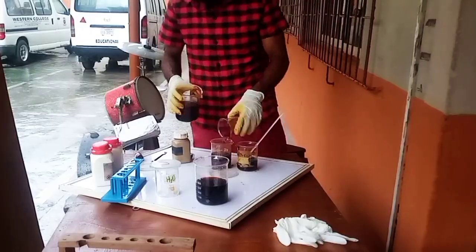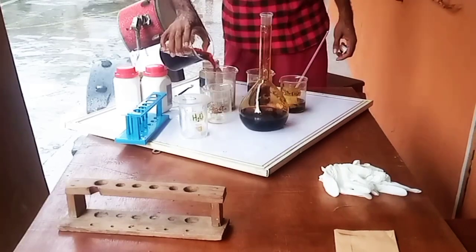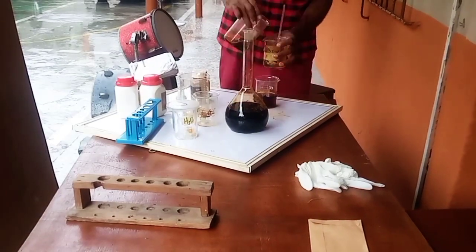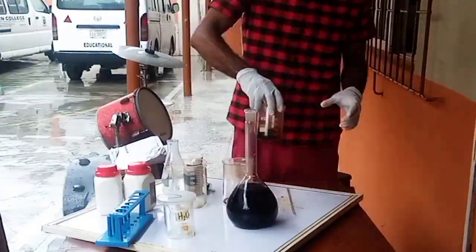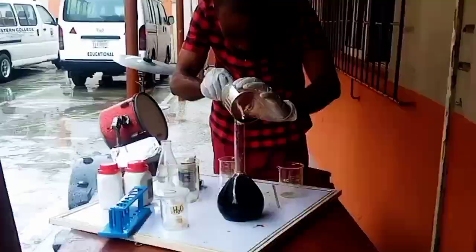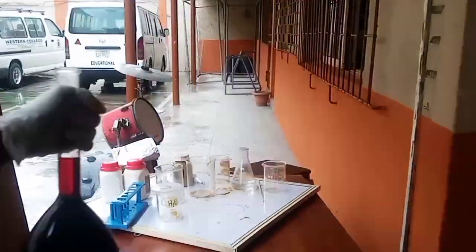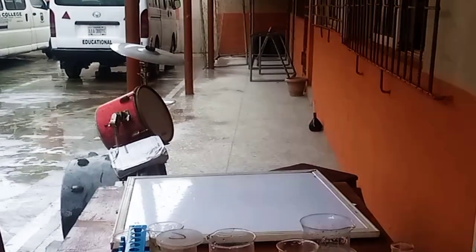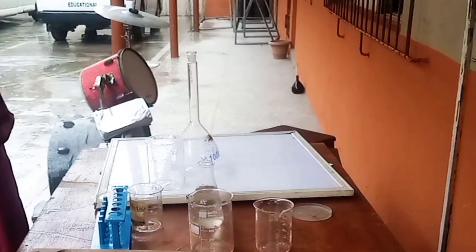I'm also going to fast forward it here again so that we are actually fighting for the data consumption. Here I am trying to complete the mark of the volumetric flask. Then I brought it closer so that you see what I want to do, and this is the 1000 ml. Okay, I need to keep it away so that I would not break it unknowingly, that is why I need to push this thing away from this place after I've checked it for a little while. I took it somewhere far away from here, and you can see where I dropped it, and I continue with the sodium thiosulfate.